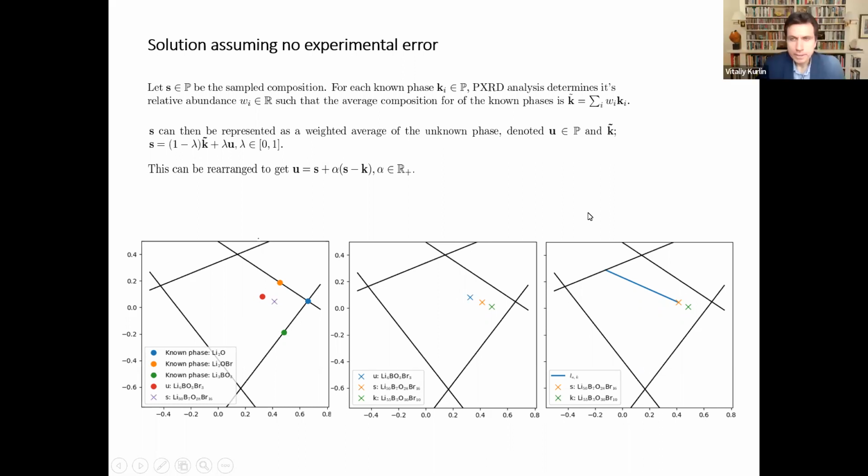Danny, quick question. So you are quickly moving to this deep mathematics, but before we go into technical details, probably this slide is most important for understanding how PXRD is used, right? Yeah.